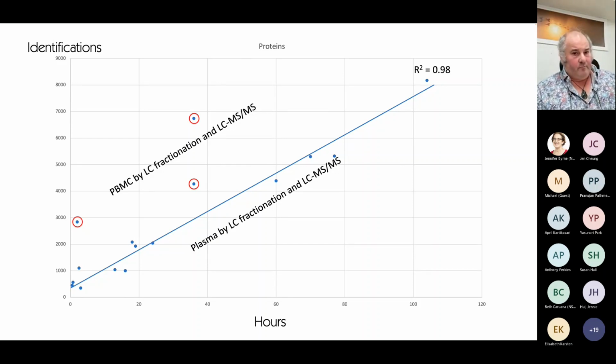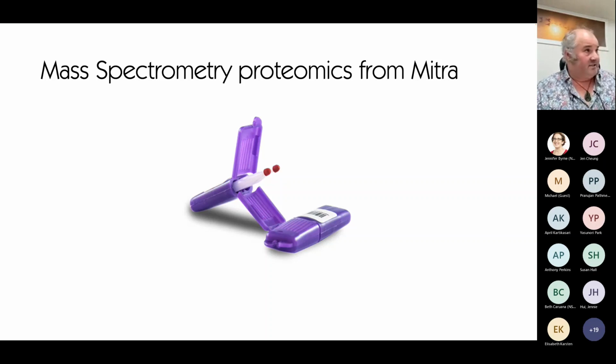And so we were really thinking, what could we do in this kind of space? And it's a very crowded space. There's a lot of people in here. And we started talking, it was really led initially by Mark Malloy, who's a colleague of mine way back from our PhD days. And Mark is the Professor of Colorectal Cancer Research now at the University of Sydney, and he's based at the Kolling. So we started talking about doing mass spectrometry proteomics from these dried blood spot devices.